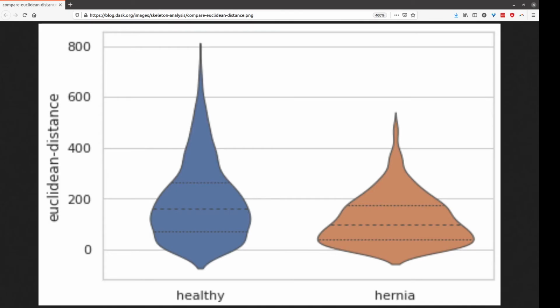So you can see that the branch statistics are very different. Some of the biggest differences were really obvious even without graphs. In particular, there were just many fewer blood vessel branches in the hernia model than in our healthy case. That makes sense because with the hernia model, the lungs are underdeveloped, they're quite squashed, but we also see differences in the branch distances of the blood vessels that do exist.